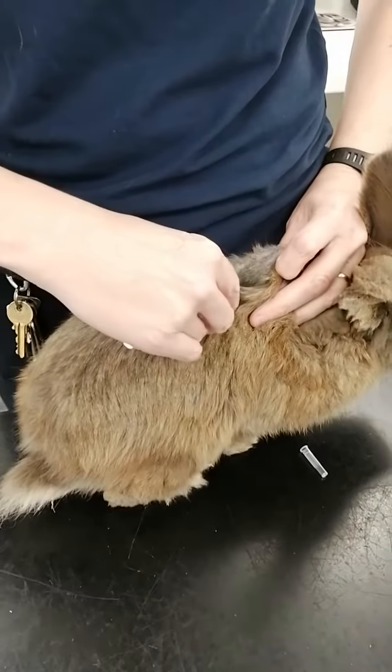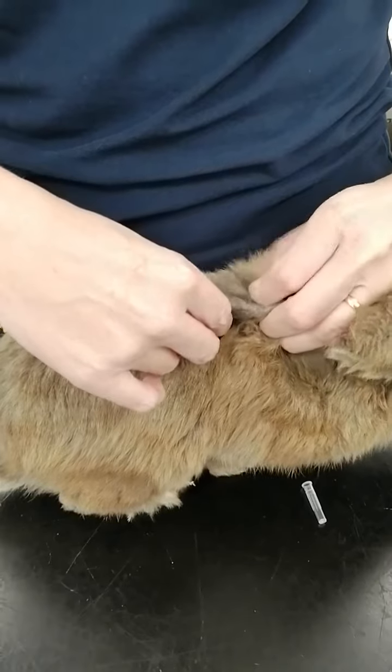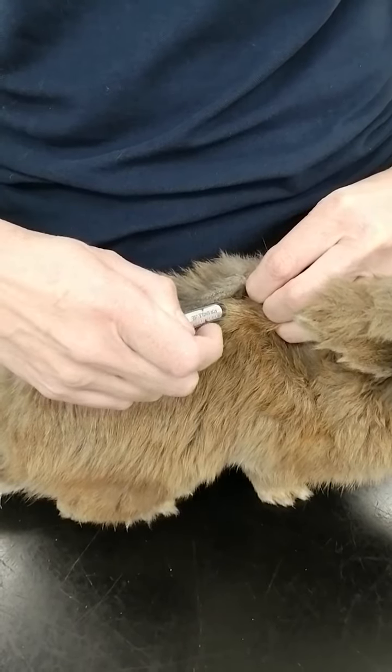Still holding it like a pencil, we're just going to push through the skin — you can feel it go through — and then you need to feel on the other side that you haven't pushed it through two layers, and then you can inject it under the skin.